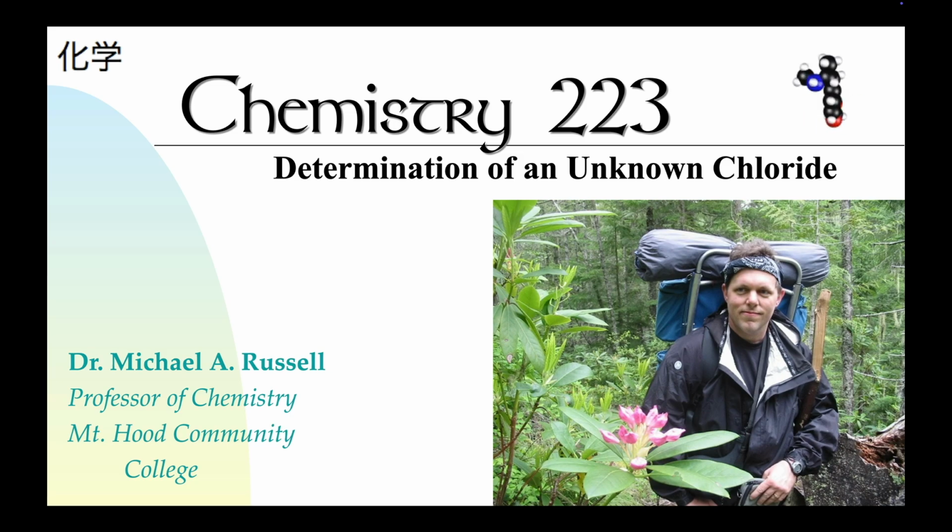This is kind of a cool lab because even though at Mount Hood Community College we oftentimes face, shall we say, considerable financial pressures, i.e. we don't have a lot of money, I feel that Mount Hood Community College is able to compete with the better schools of chemistry in this lab because this lab involves what's called a titration. And the techniques used for titrations aren't too sophisticated, too crazy. So we can do as good of a job in this lab at Mount Hood Community College as you can in the other bigger schools, which is kind of a cool thing. So without further ado, let's see exactly what's up with the Unknown Chloride Lab and titrations.